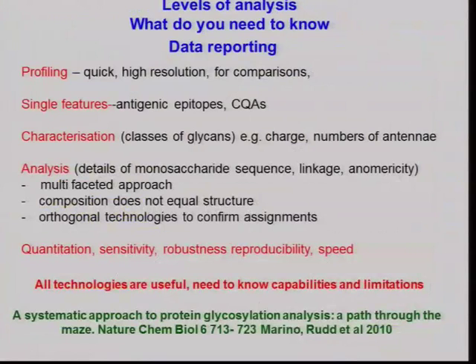So that is one reason for doing glycan analysis, but of course there are all sorts of other reasons why you might do glycan analysis. So there are different levels that you can undertake. Before you ever start a glycan analysis, you need to know what it is you need to know, because doing a complete glycan analysis may be very important for some things, but it may actually not be relevant to other things. So before you even decide which technologies to use and what information you're going to report, you need to understand what it is you need to know.